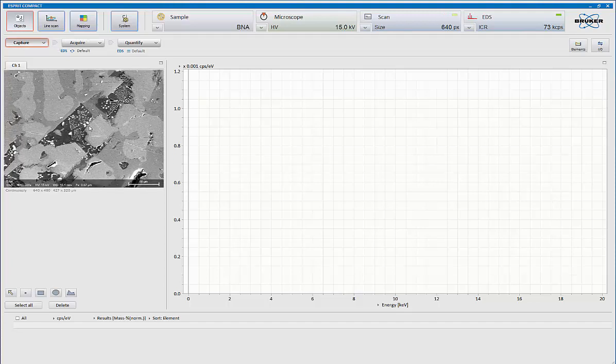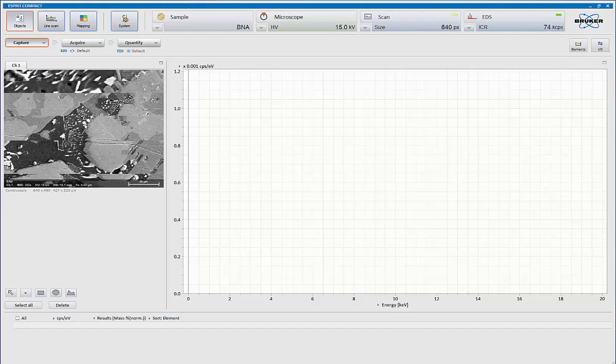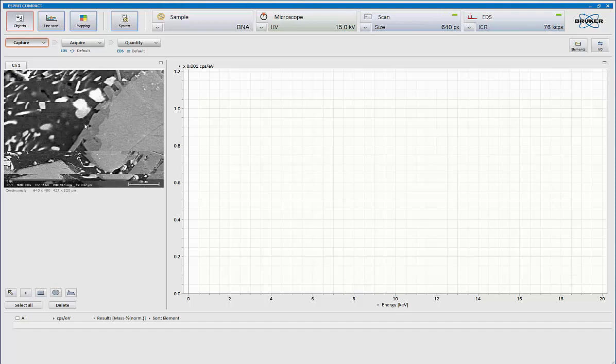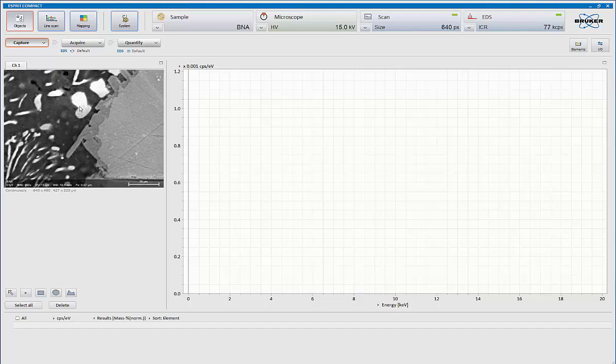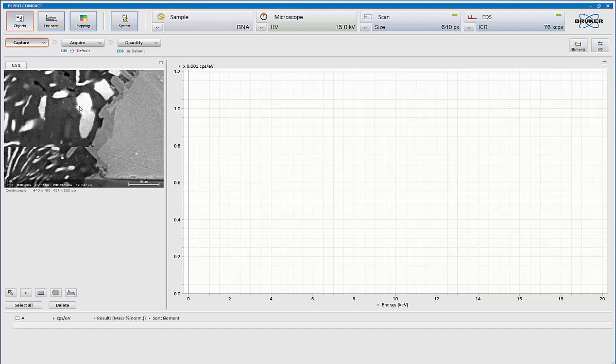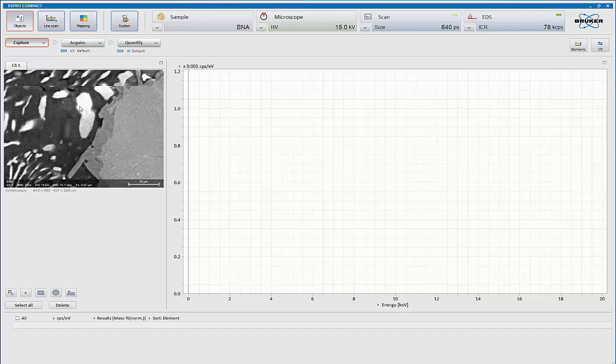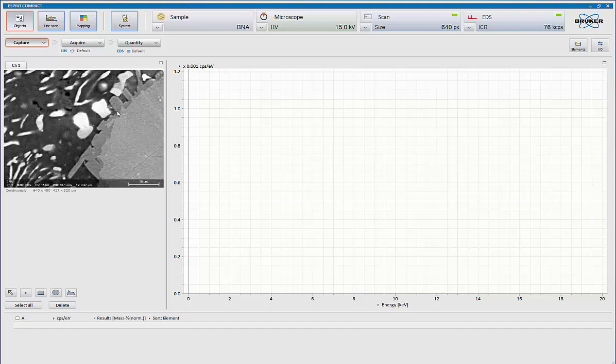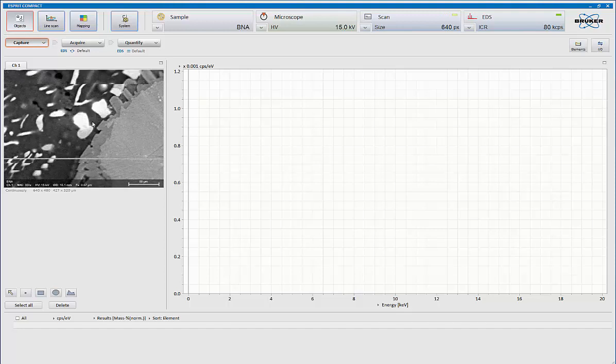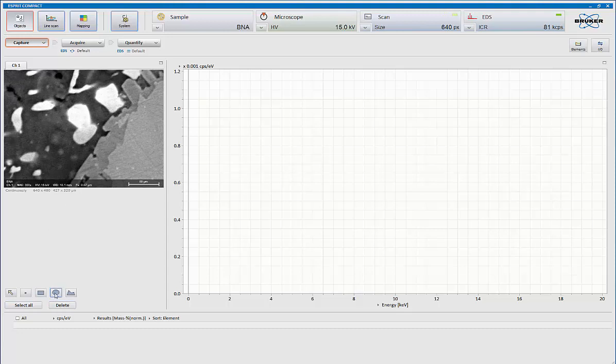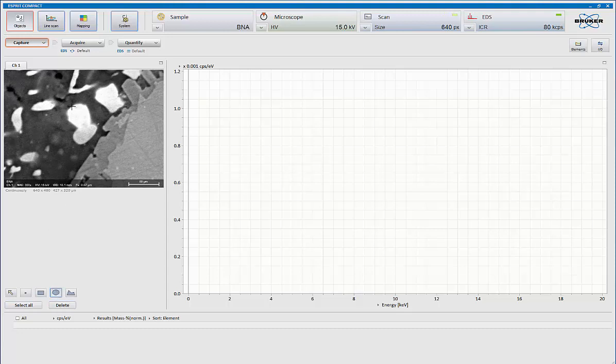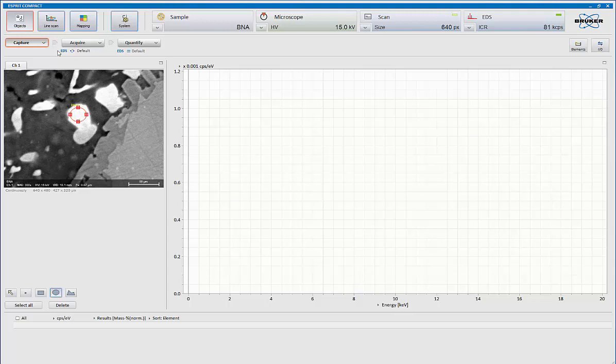What I'm more interested in right now is I'd like to analyze one of these very bright regions. So with that, let's zoom up a little bit more. I'm going to use my annotation here and I'm going to highlight just within that region there.